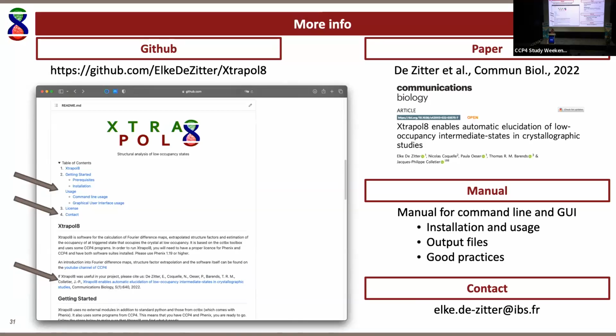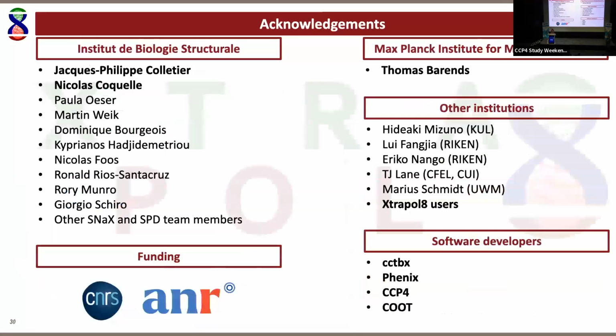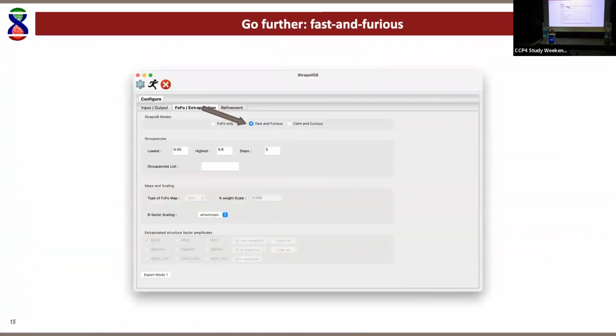With K weighting, you also have an additional scale factor, which you also want to change, but I would have to go into the mathematics to show you what this scale factor does. So basically Q weighting would normally work, but it might be that the K weighting gives you better results. That's why I say it really depends on a case-to-case basis.